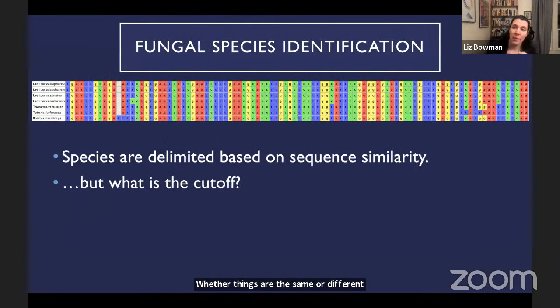Okay, so I took some DNA and I sequenced it and I got some sequences back. So these are the final sequences that I got back. And it's really small here. I should have gone in to make this bigger, so I apologize.